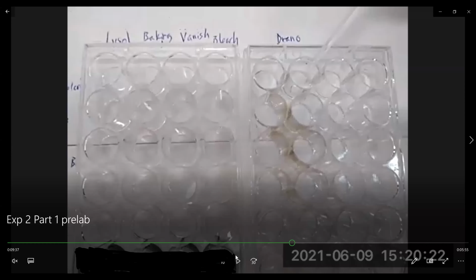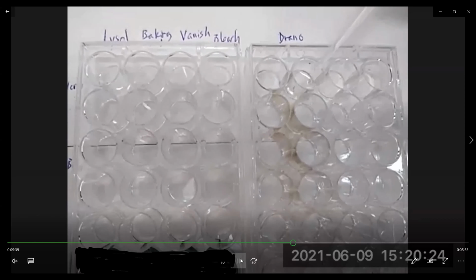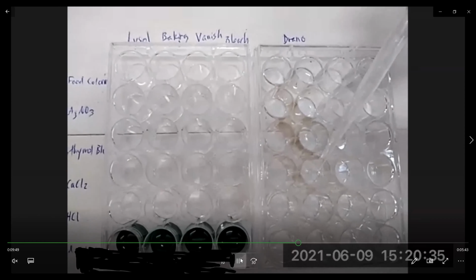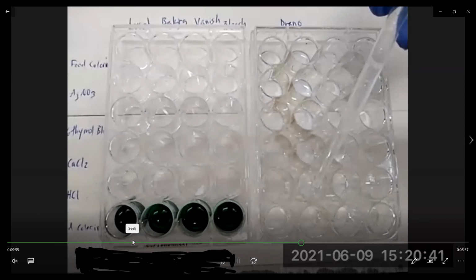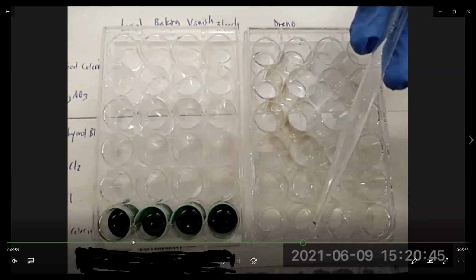So now we're adding the Drano and showing you how each reagent reacts with the Drano. So again, 5 to 10 drops of Drano. Disregard the stuff you see in the lower left-hand corner. We had a fiasco with the green food coloring experiment.